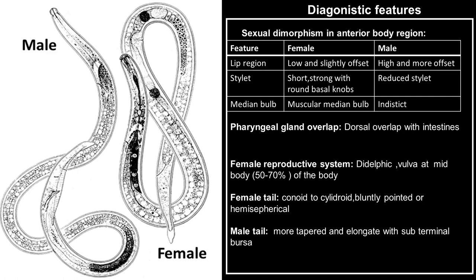These features include the sexual dimorphism in the anterior part of the body. The female nematodes have a lip region which is low and slightly offset. They also have a robust and strong stylet that has round basal knobs. The female also have a distinct pharynx with a metacorpus median bulb.